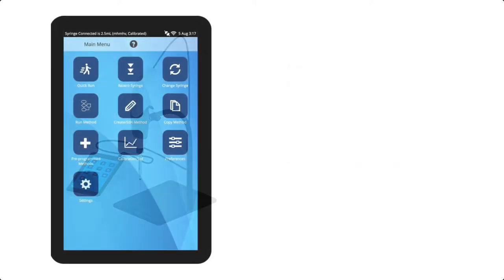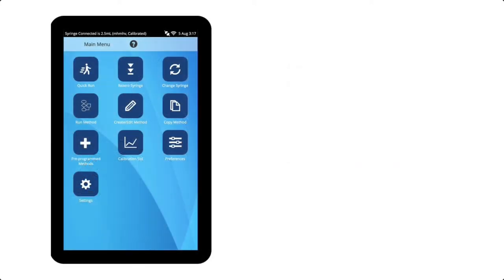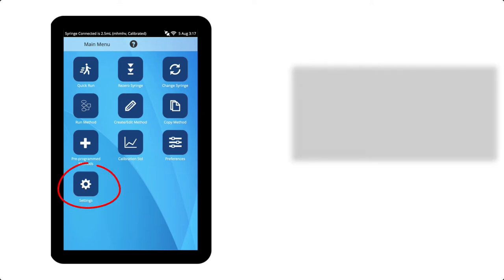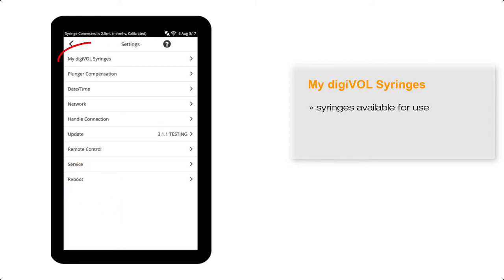Let's go through the process in the software of letting the Digivol know the syringes we have available, and then we'll calibrate some syringes. In the settings module, we have an option for My Digivol syringes. I'll select this.